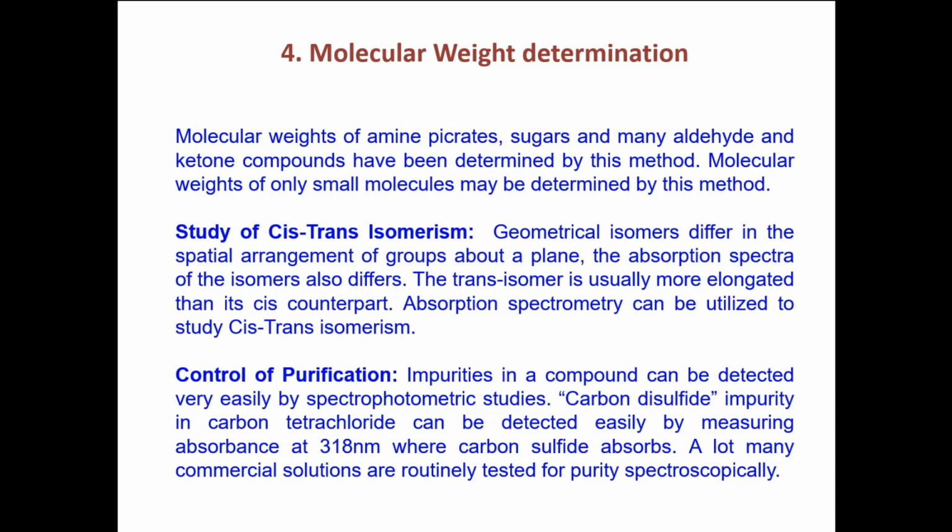The next is the study of cis trans isomerism. You know what cis and trans isomerism are. If you remember, in case of glucose, especially in chemistry, you may have studied what the cis forms and trans forms are, right? Cis and trans isomerisms. Is it not?